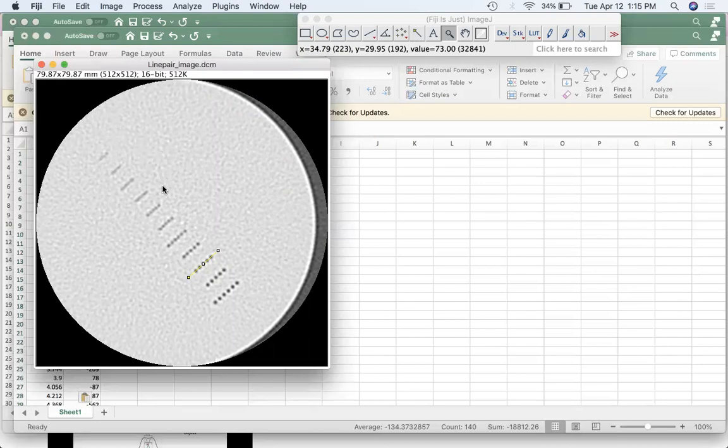So that's a quick way to get started. I think I've given you everything you need to use for the homework. And so, have fun looking at all you want to look at with this program.